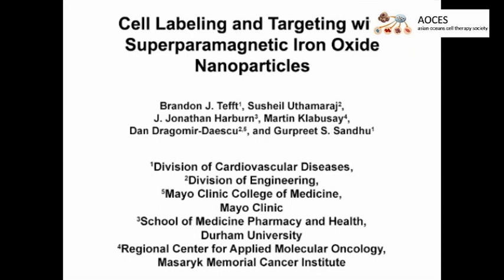The overall goal of this procedure is to synthesize superparamagnetic iron oxide nanoparticles and to use those particles to label cells for magnetic targeting and sorting applications.